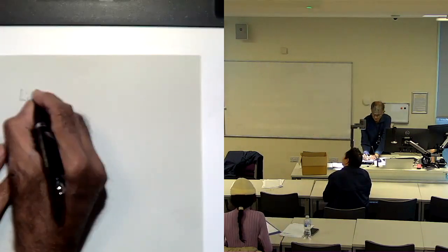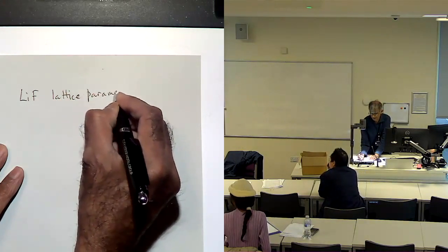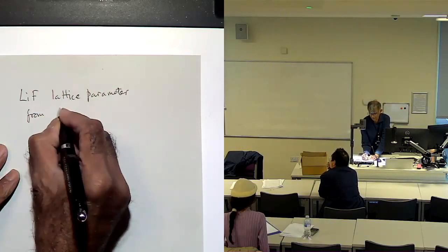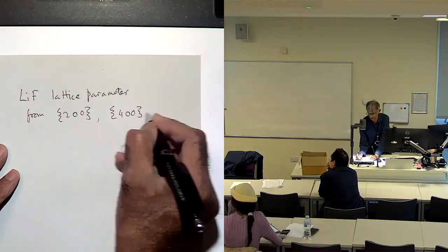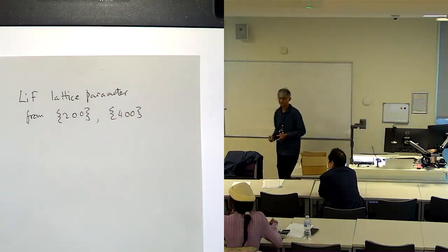So lithium fluoride, from 200 and 400 planes of the cubic crystal.